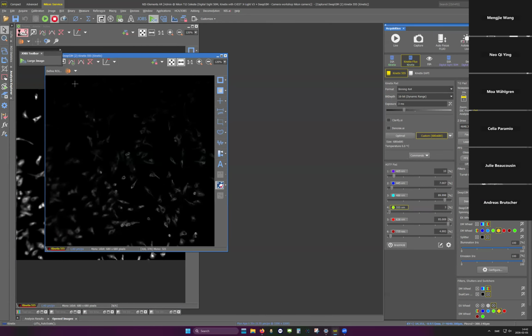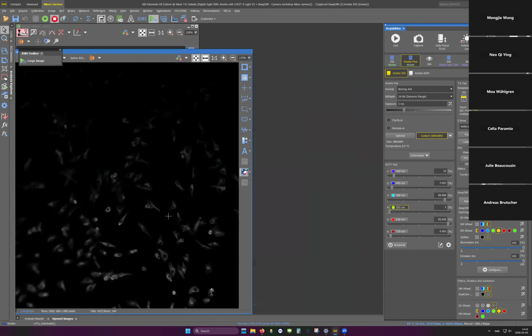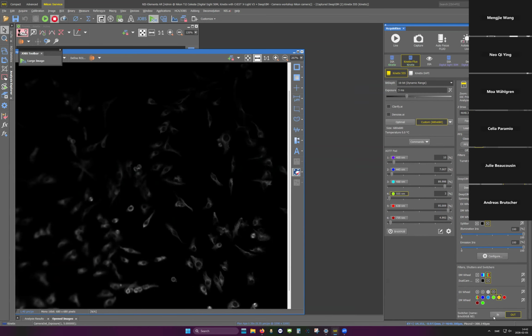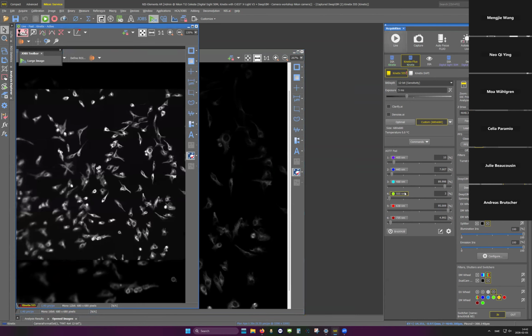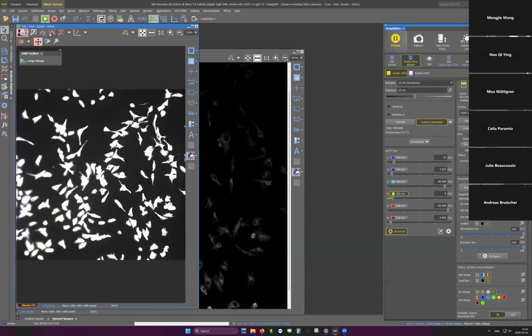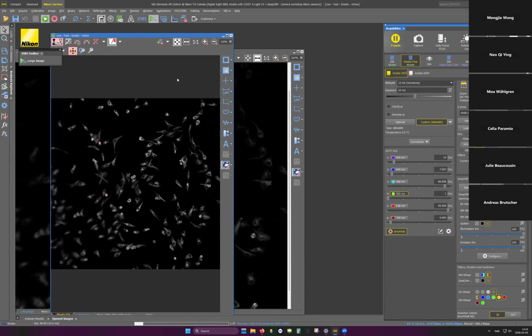I think I still have the problem with the laser. It's the laser, too short exposure time. Yeah, exactly. So what I'm going to do is, you can put in the new ND filter, I can do that. And maybe then you have to push the lasers. There we go. Just going for saturation, no. Something like that.